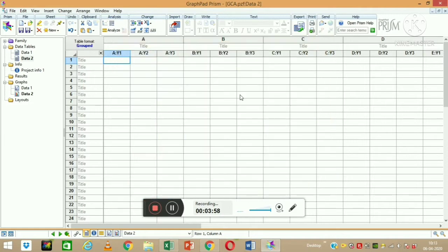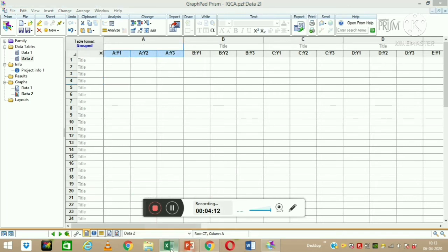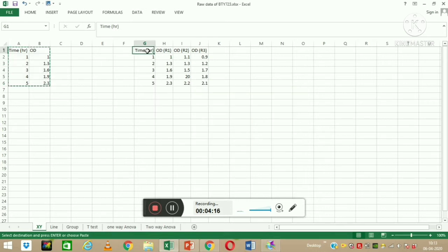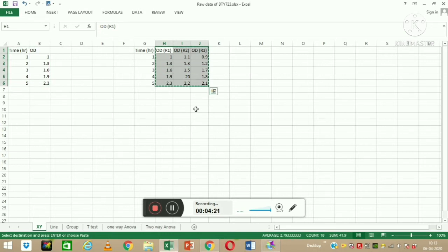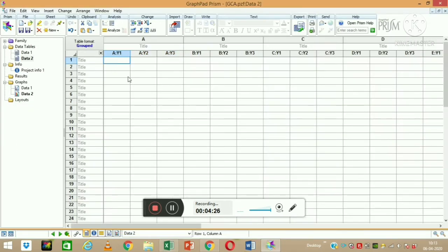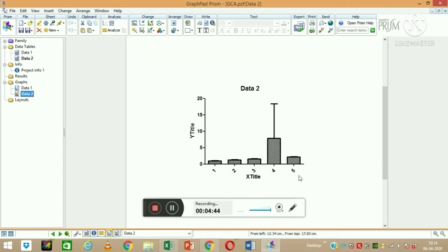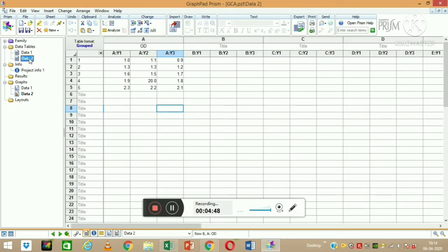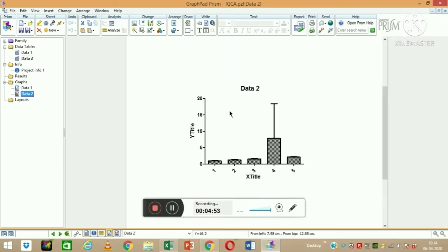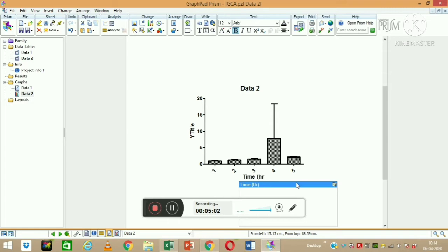After clicking Create, to fill a single Y parameter we have to fill in all three replicate columns. I'm copying replicate one, replicate two, and replicate three data and pasting it here. I'm entering OD on the Y axis and the time values — one, two, three, four, and five hours — on the X axis. This is how we can create XY scatter graphs with replicate data.